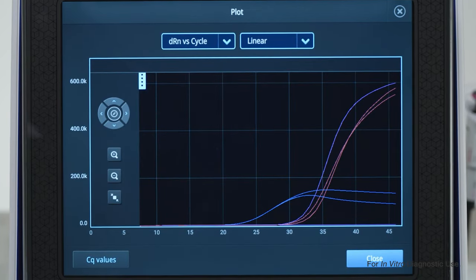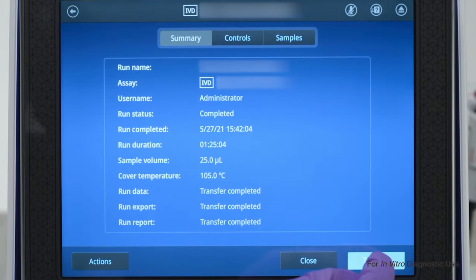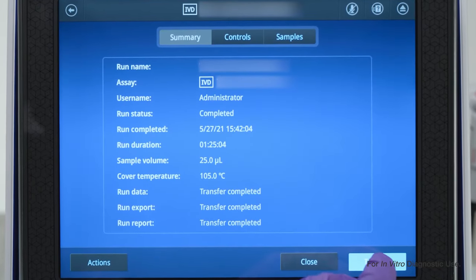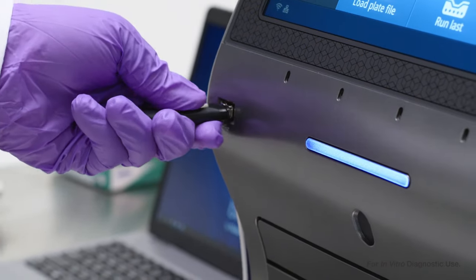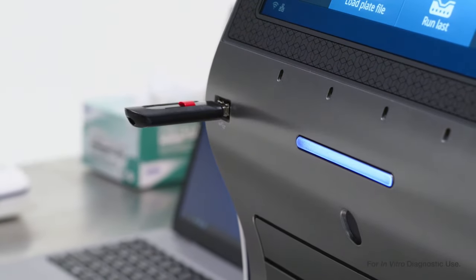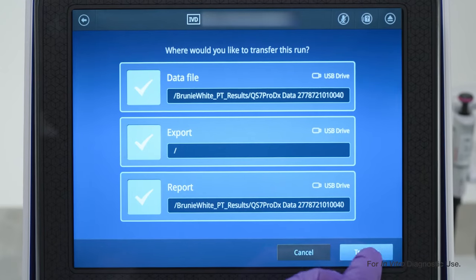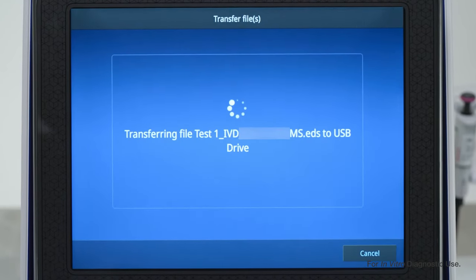Afterward, you can review results on the instrument, or you can customize export settings and export onto your local network or USB drive.